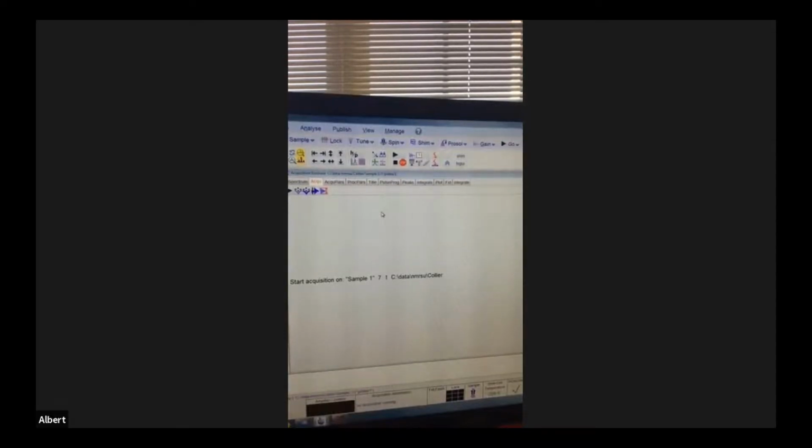You'll see the tune again. That parabola is going to come up. Is it done? Nope. The parabola has to come up. Did it come up already? No. Yeah, it'll come up. What does it say, Y equals X squared? Job succeeded? Yeah. Okay. All right, you can click spin now. Since I tuned it on the last one, it might be faster because it's already ready for another sample. So click RO on.